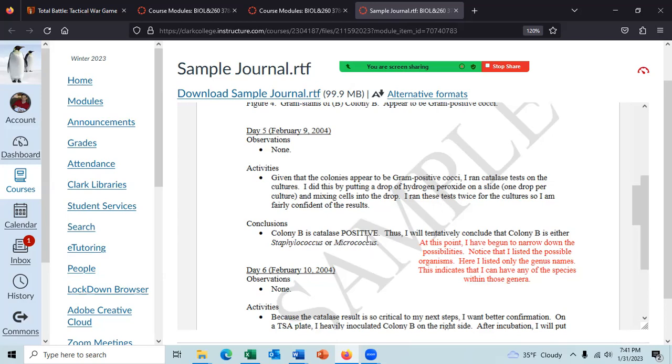Okay. And this is a good way to separate out your lab report, where on one day you give the date, and then you separate it into observations on the tests that you requested earlier and you got the results to. And he could have put here observations on the catalase test, and he doesn't have that.